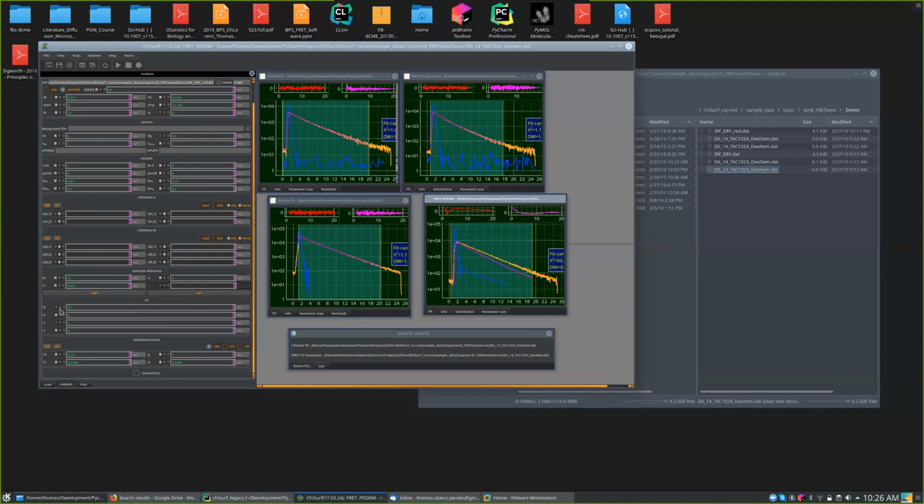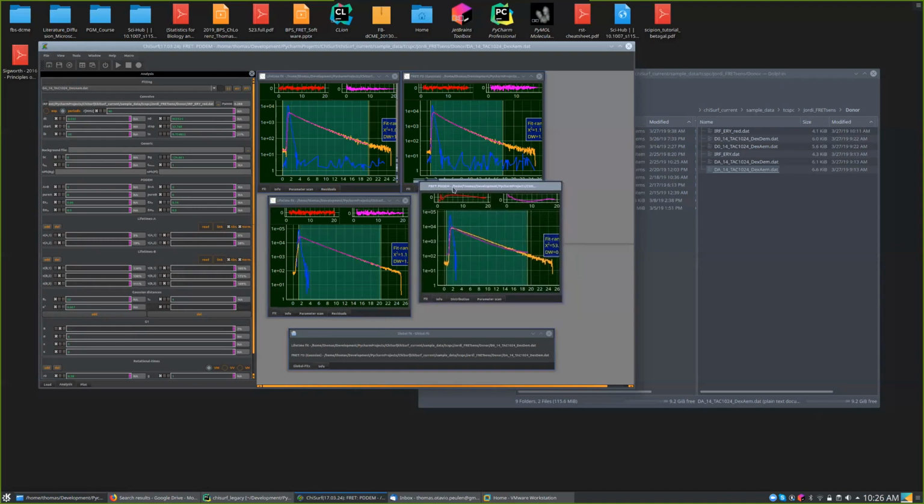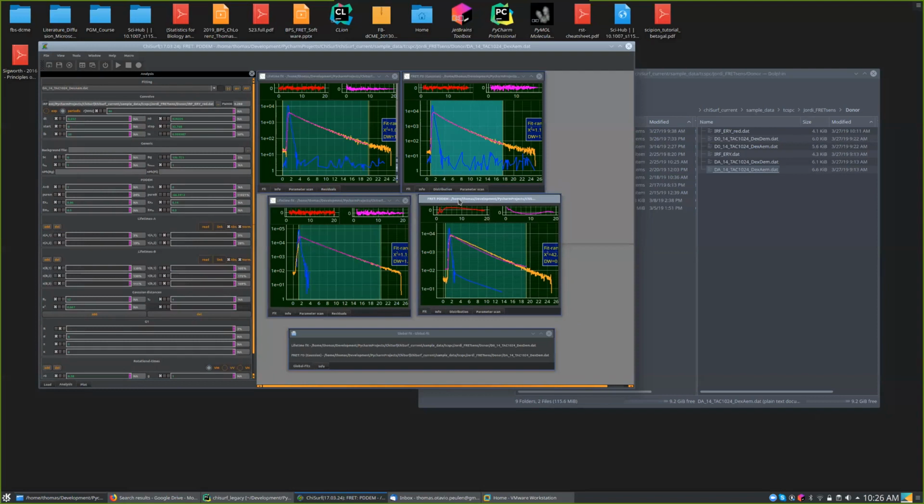Now here, this you can connect now again, like in the same manner to the distance of the donor, and this fraction we can in principle fix. So now if I click here on fit, you see it doesn't fit. Okay, now here like this pure A, I connect to the fraction of donor only. And pure B, this we don't know. We don't know how much acceptor only we have, so we don't know it. Again, it doesn't fit. Maybe we set it to 0. Just said like you wash it away.